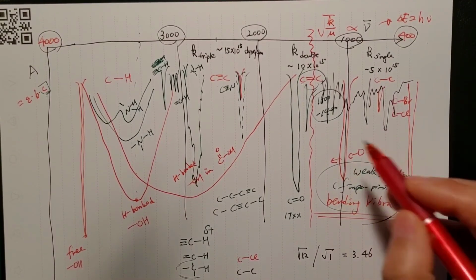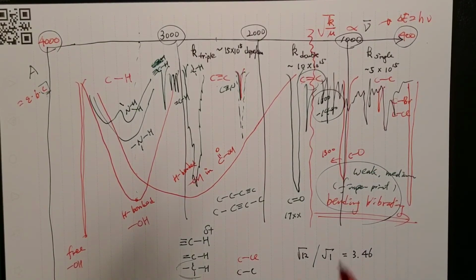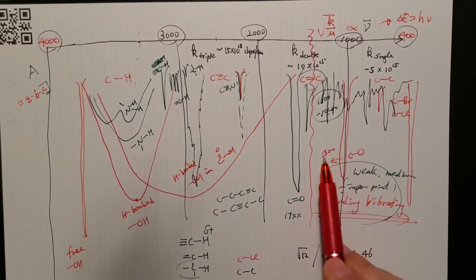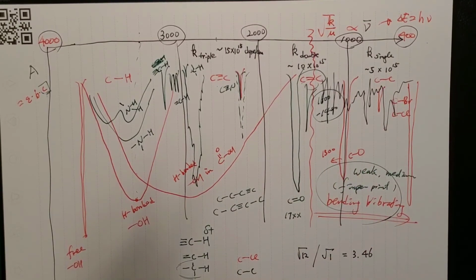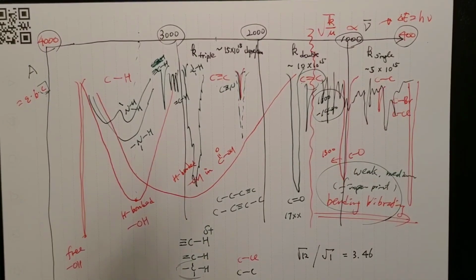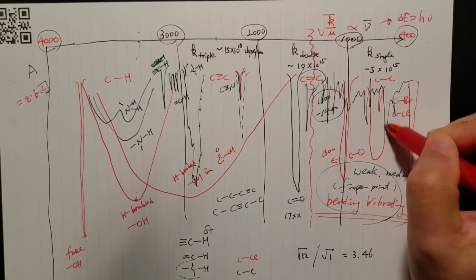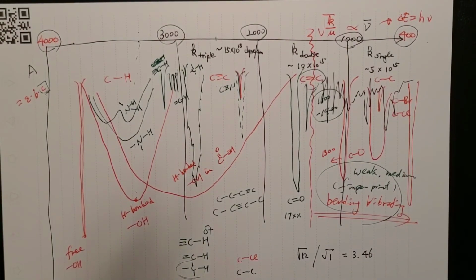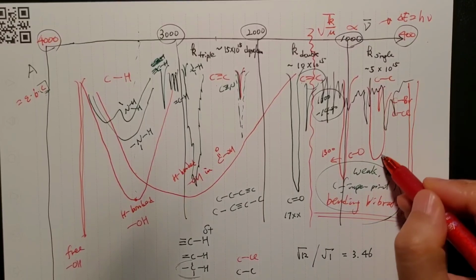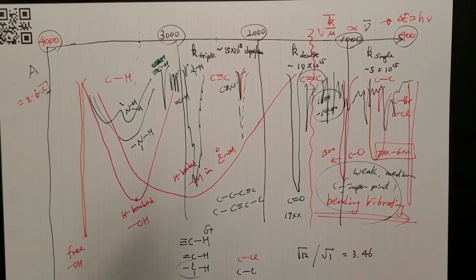So how far can this go? It can go as far as even 1300. So I would remember a CO single bond at around 1000 as the maximum value for a single bond, plus or minus a couple hundred easily, okay, more to the plus side most of the time. Then you have chlorine giving a somewhat broad but intense signal, and bromine a little lower, and they are normally around 700 something to 600 something. That's enough.